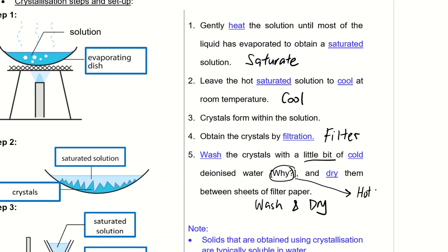Because hot water will dissolve all the crystals.